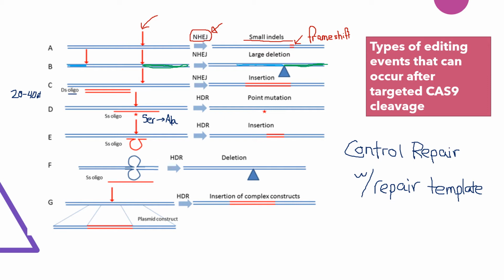Okay. Correction. So in this case, you can see this with the red. We'll still use our blue and green homology. We can do a small insertion by an oligo. So we'd have homology here on our oligo to the blue. This part would be the blue part. We'd have homology to the oligo, and this is on either side of the cut site, to our green part. And then we have new material that is stuck on the oligo, made in that oligo on a machine. It doesn't involve much labor. You just order it. And so after the cut, when this repairs, you've introduced material into the genome.